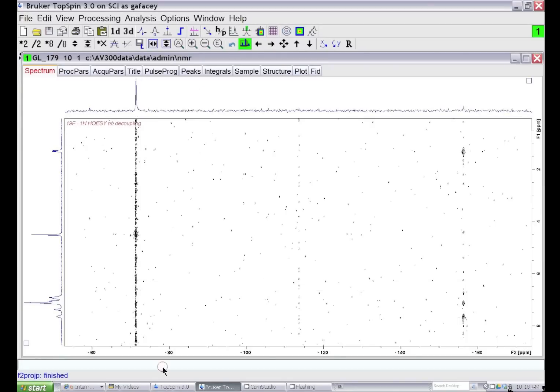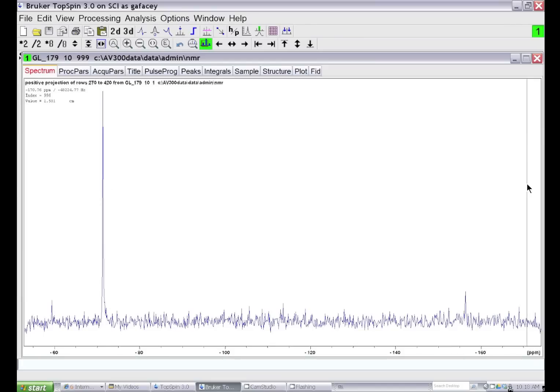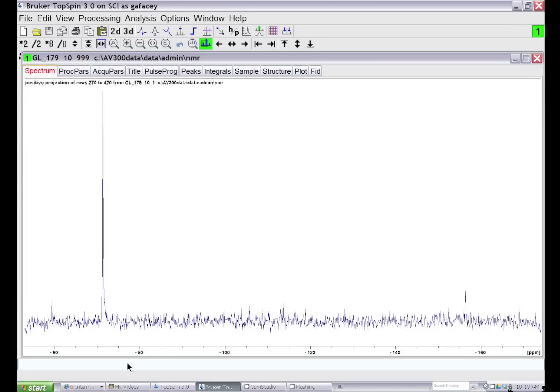If I read that projection by typing REP999, I can see the projection, which is just the T1 noise in that region of the spectrum. I'll go back to the NMR spectrum, REP1.